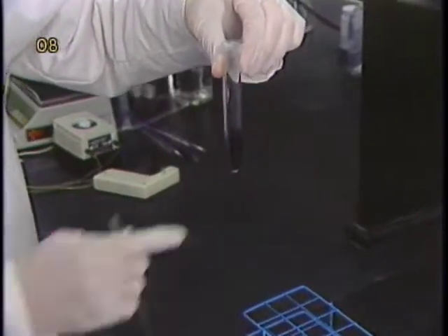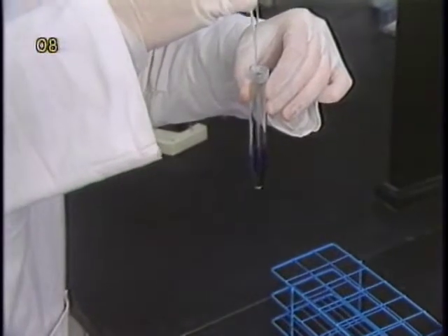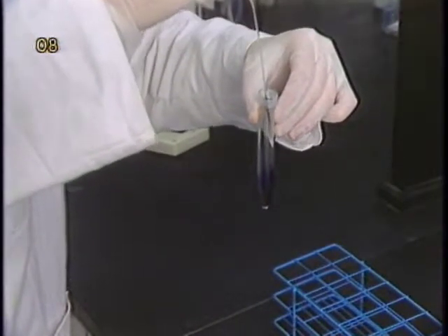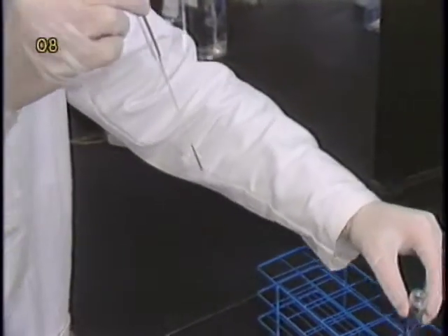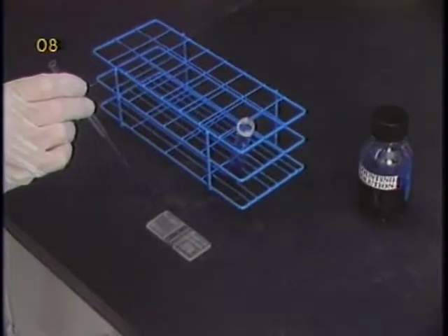After releasing all the nuclei into the counting solution, you are ready to count in the hemocytometer. In general, nuclei stay in suspension relatively well. However, if the nuclei suspension has been sitting for some time, mix it gently before placing it in the hemocytometer.